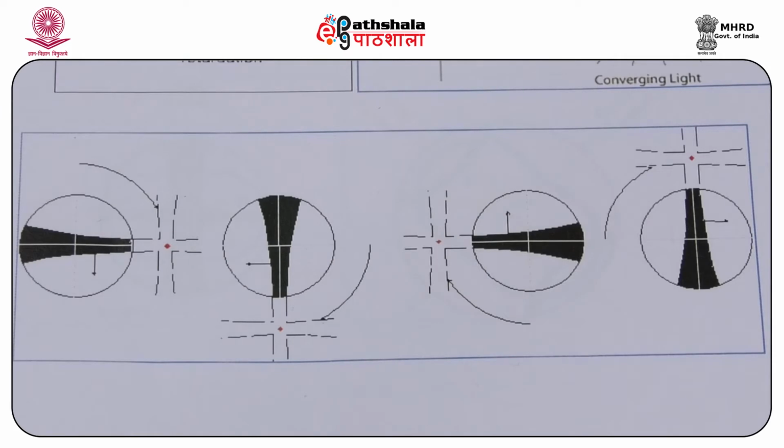The second figure which a uniaxial mineral can produce as an interference figure is the off-center interference figure. In the first case, we had seen that the optic axis is perpendicular to the direction of vibration. If the optic axis is inclined from the vertical, the interference figure will no longer be centered in the field of view.